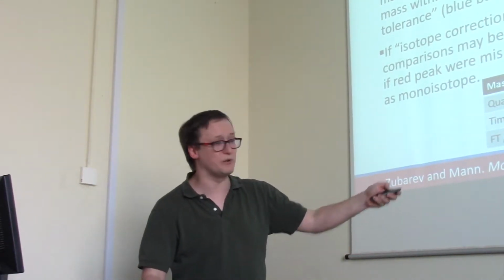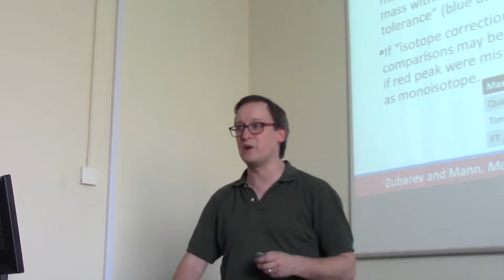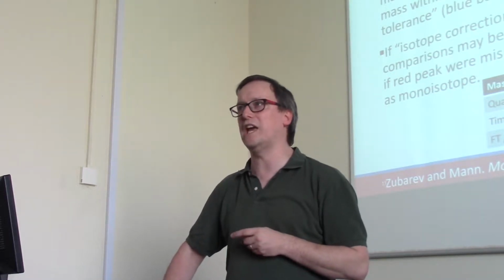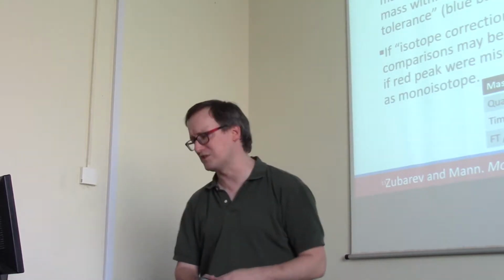And instruments like the Orbitrap Fusion that we have over in the Proteomics laboratory are typically correct on the mass within 10 parts per million. So you can imagine that if you know the mass of a peptide in Daltons, that's like being accurate within, say, 0.002. It's incredibly good. Very, very high mass accuracy.